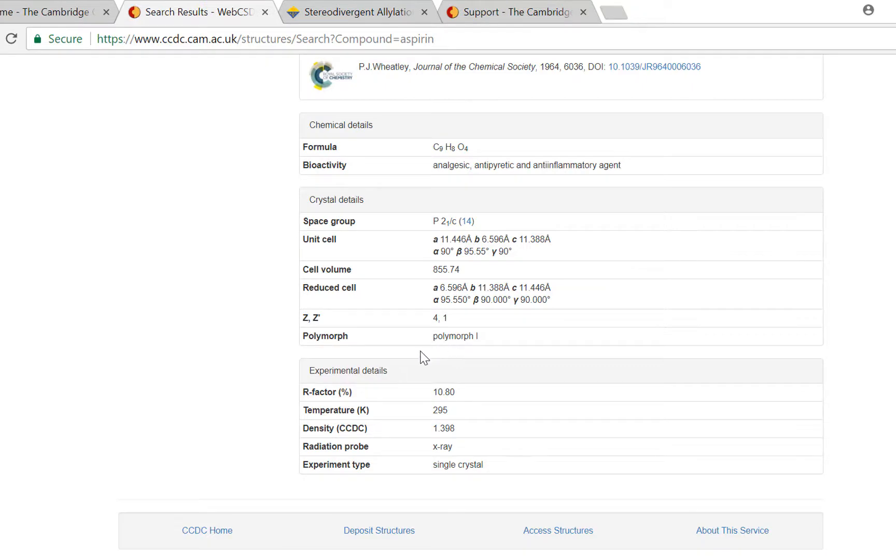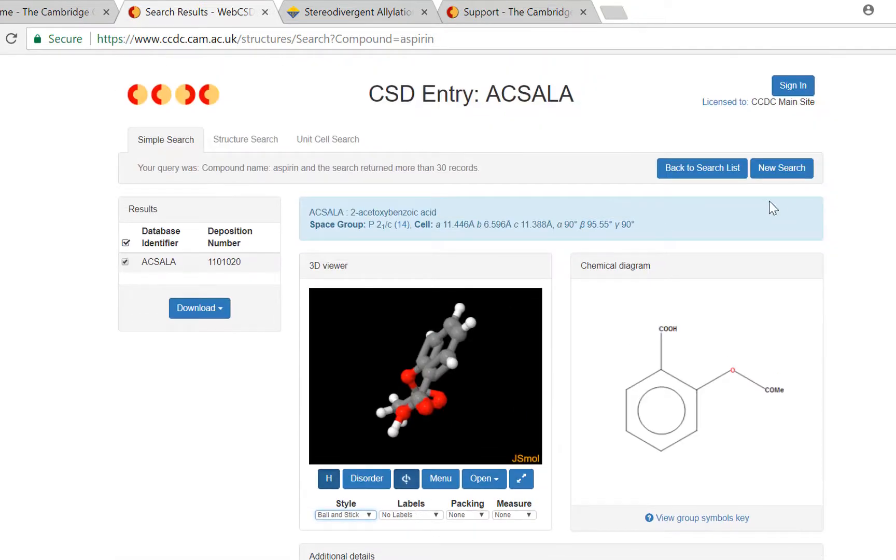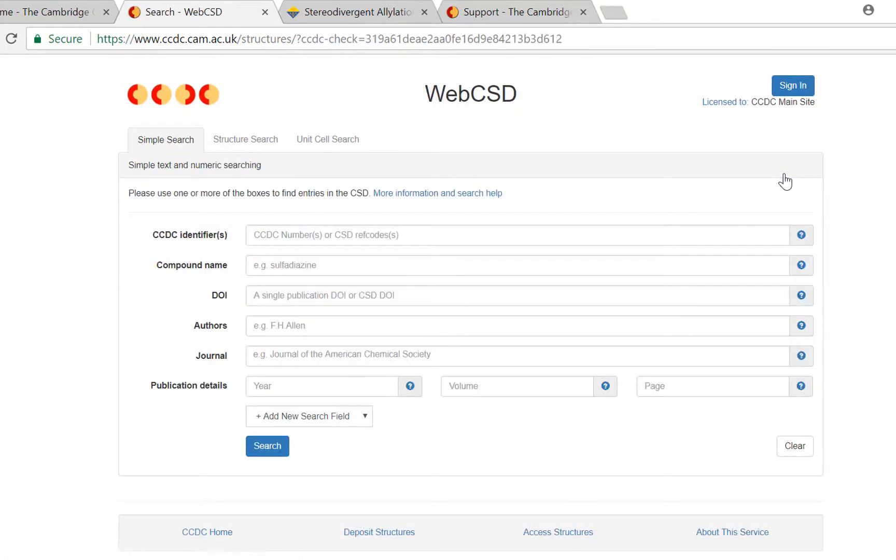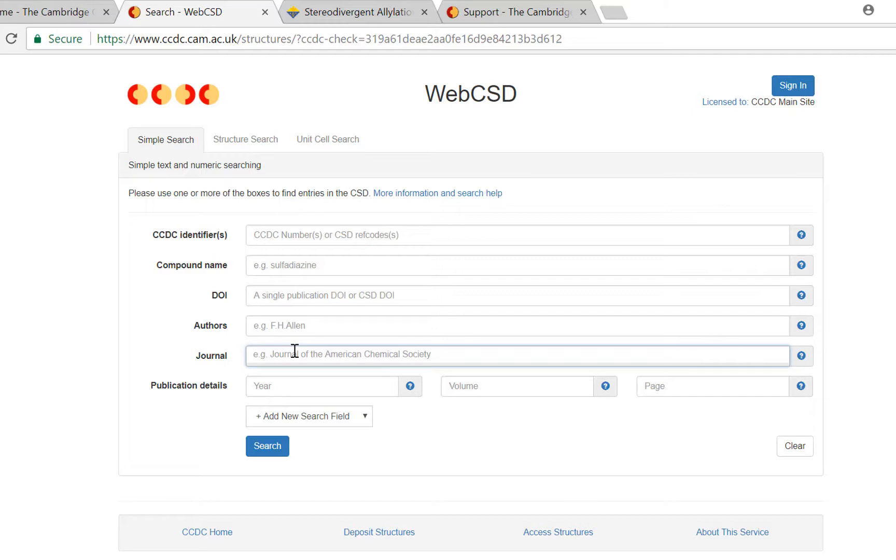So now I'm going to show you a second method of searching, this time using publication details. I would like to see some of the crystal structures that have been published in the Journal of American Chemical Society this year.